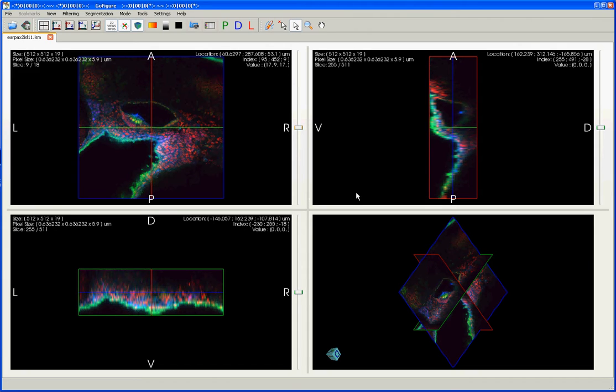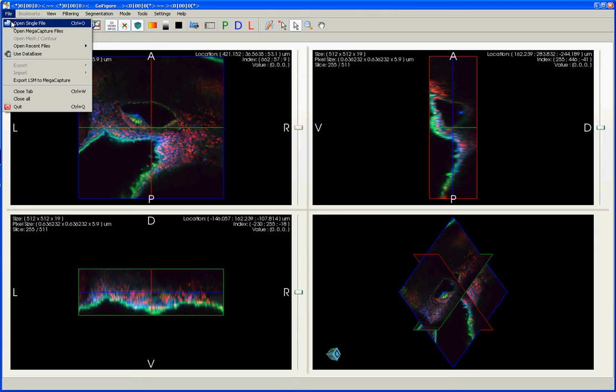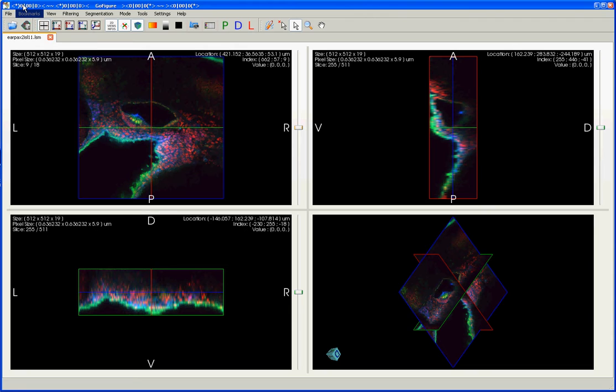Here, I already have an image open of the zebrafish ear, but to open a file of your own, you can go up here to the File menu and select Open Single File, or alternatively, just click on this button right here.